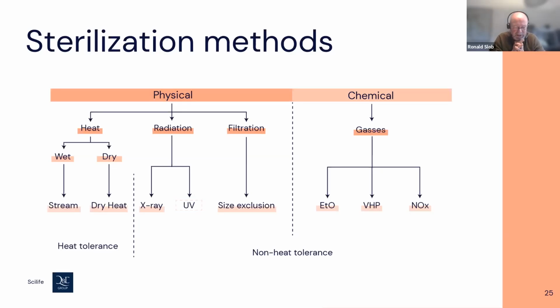So one of the things is, if you want to go into this sterilization part of your materials or media or something else, first look at, okay, can it be heat resistant? Can I use steam? Yes, no. If I've got no, then I've got other options. And when you have other options, just be familiar with where the critical parameters are for these kinds of processes. And there's a lot of information on the internet about these kinds of things.